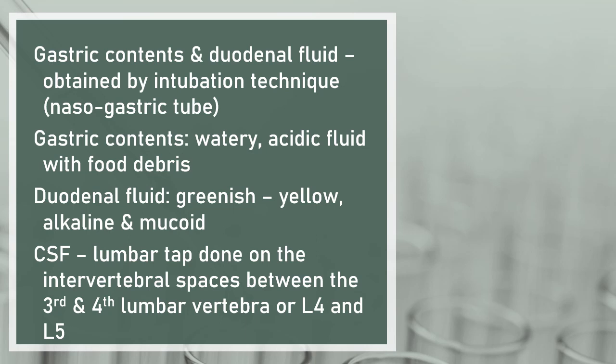You use a Vim-Silverman needle, and 1 ml or 1 cc of CSF fluid is necessary. Of course, your CSF is relatively difficult to obtain. But if there is an effusion, this is already pathologic.